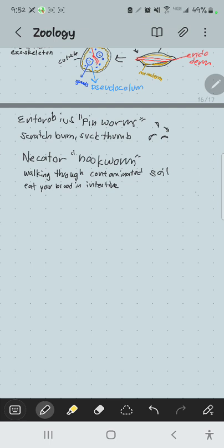This is a much larger one. You can see it there. But on the exam, I'll probably have the Necator on a slide, and you'll have to basically say it causes hookworm. How do you get the disease? Tiptoe through the tulips, right? If you walk barefoot in a pasture, they drill into your foot. And they basically live in your intestine as an adult. Is that good? Okay, hookworms, fun.